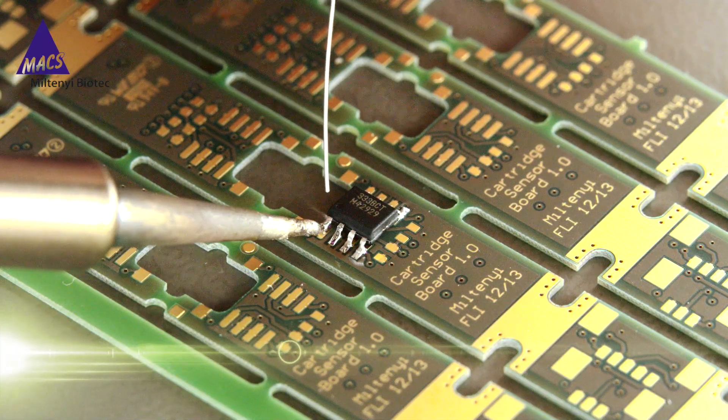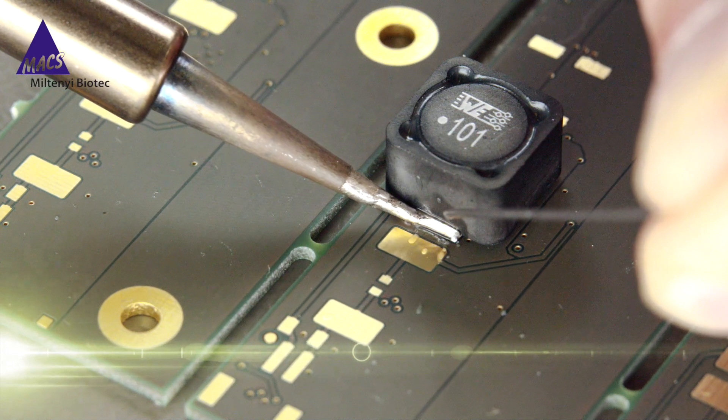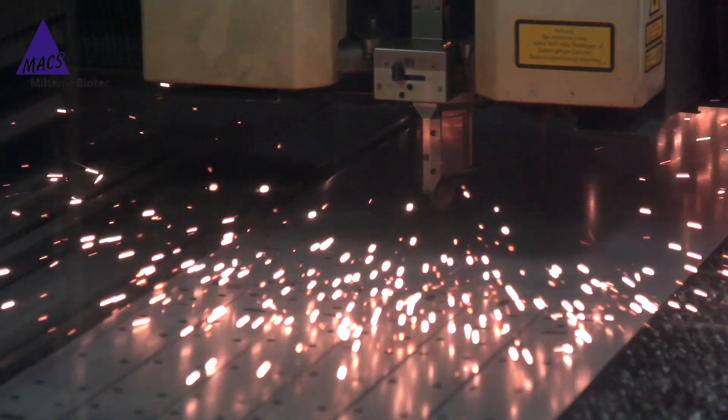How would it look? What would it sound like? How would it feel against your fingertip?